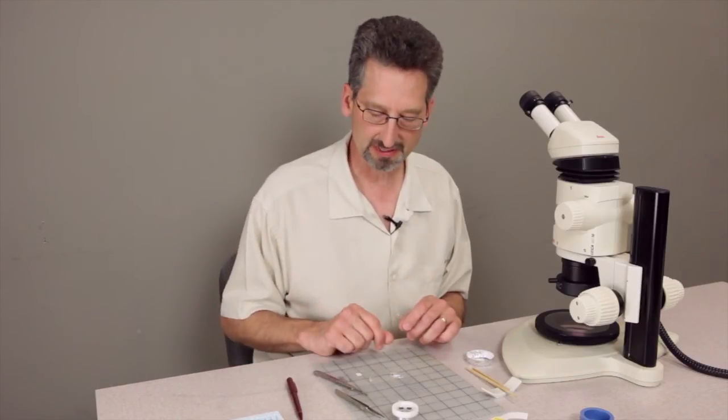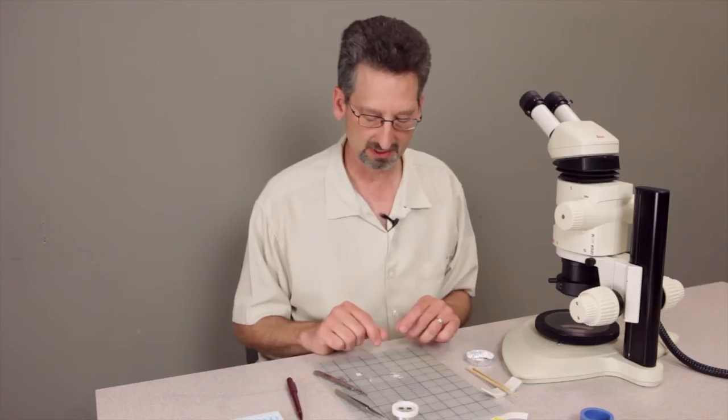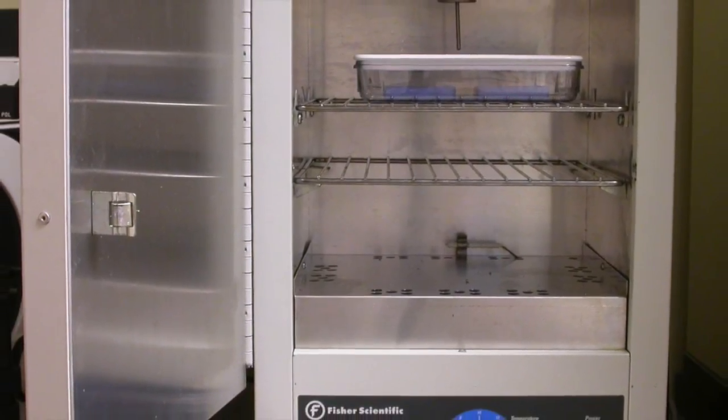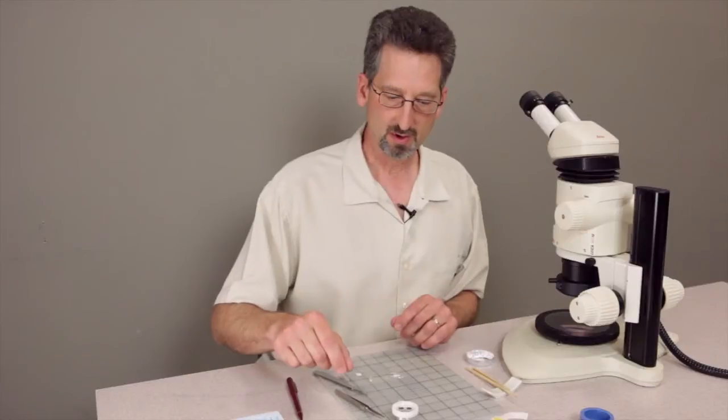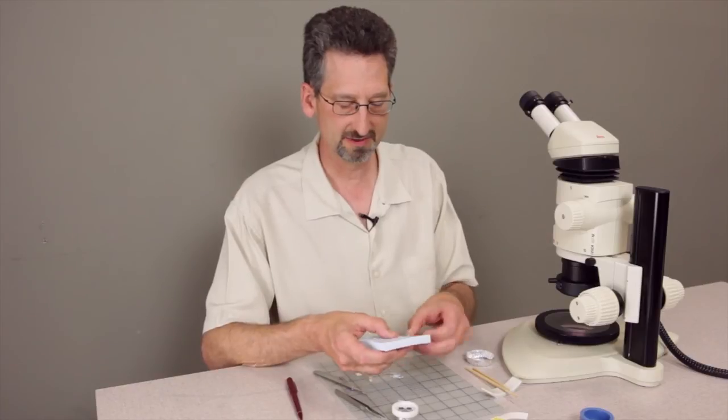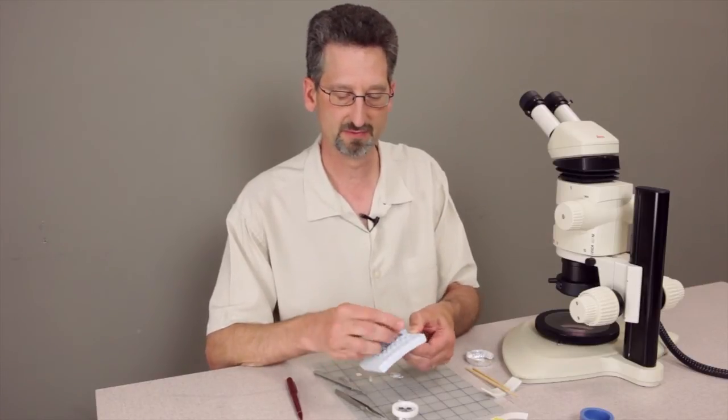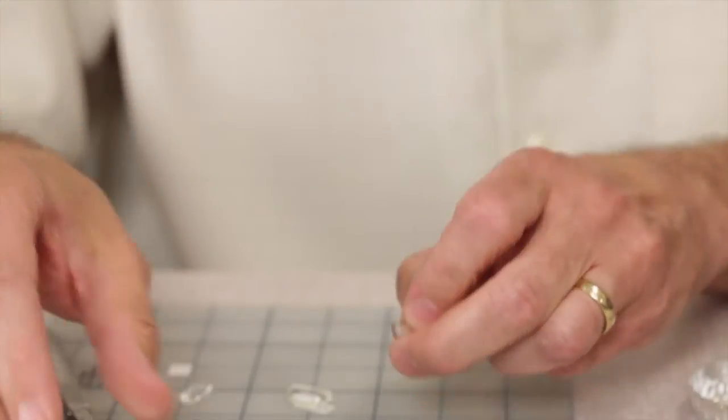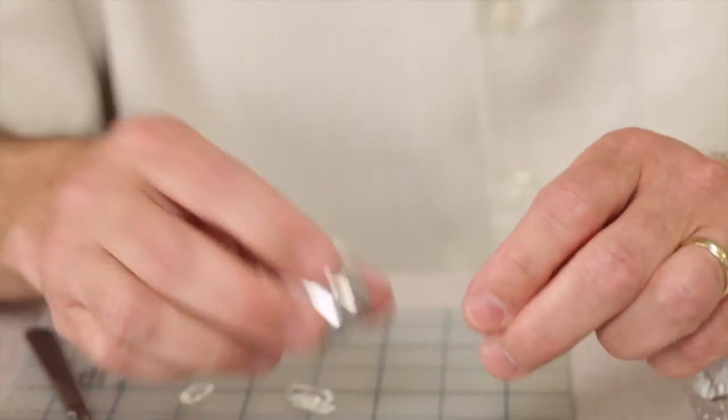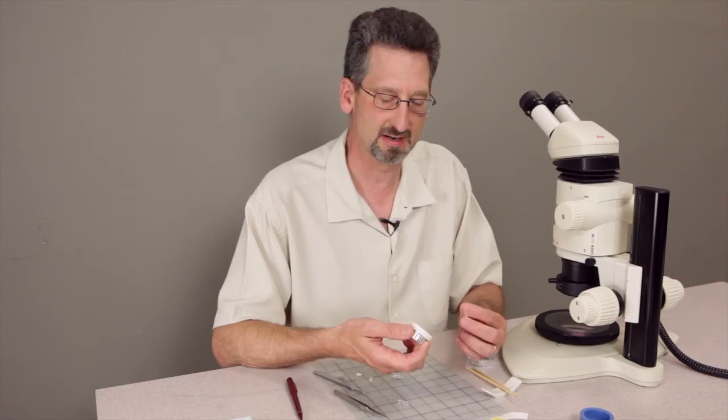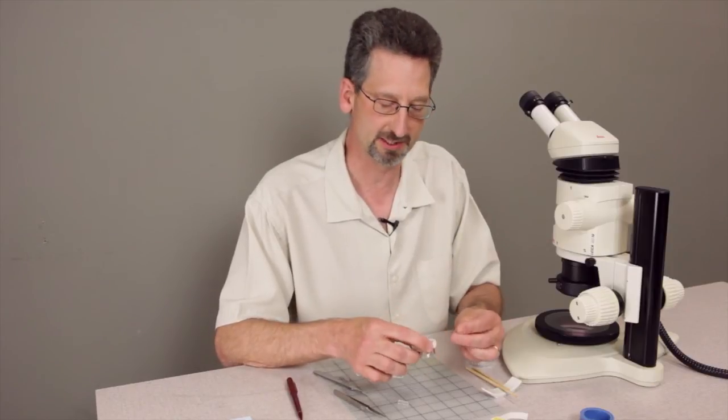The next stage is to cast or cure that in an oven and that might take about three hours. Once it's out of the oven you can pull the completed casting out and then position it in the holder and clamp that in the holder and you'll be ready to go to the polishing stage.